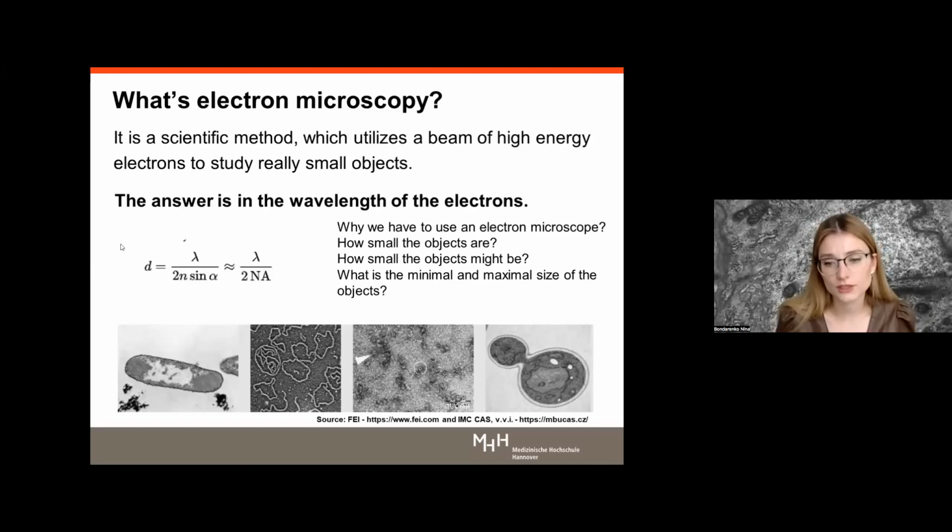As a result, the resolution that can be obtained from light microscopy is less than we can obtain during electron microscopy investigation, because in transmission electron microscopy we use an electron beam as the source of illumination of the specimen, and as a result the resolution of our method is much greater than with light microscopy.